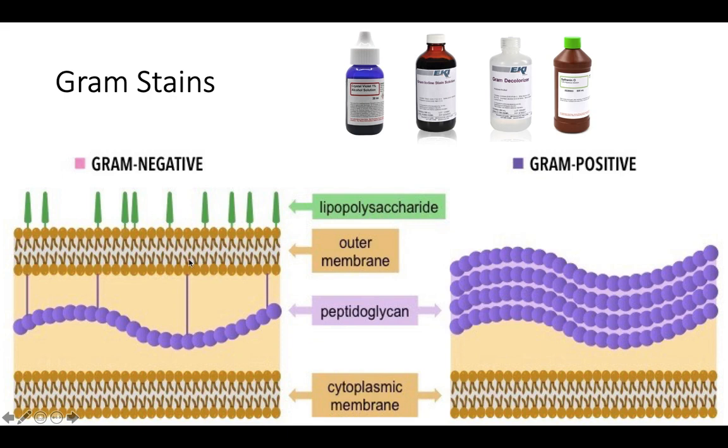Now over here in our gram-negative, we've washed away the outer membrane. The alcohol did that. And now the alcohol is starting to wash away and dehydrate the peptidoglycan. It's starting to suck the moisture out of it. Well, these guys don't have much of a cell wall to begin with. And when the moisture inside of their cell wall starts to be sucked away, starts to dehydrate, their cell wall will break.